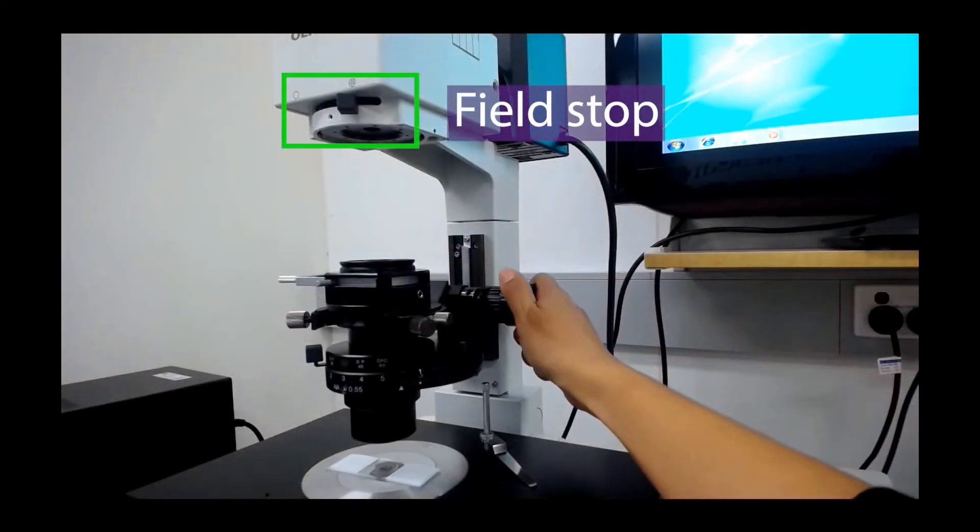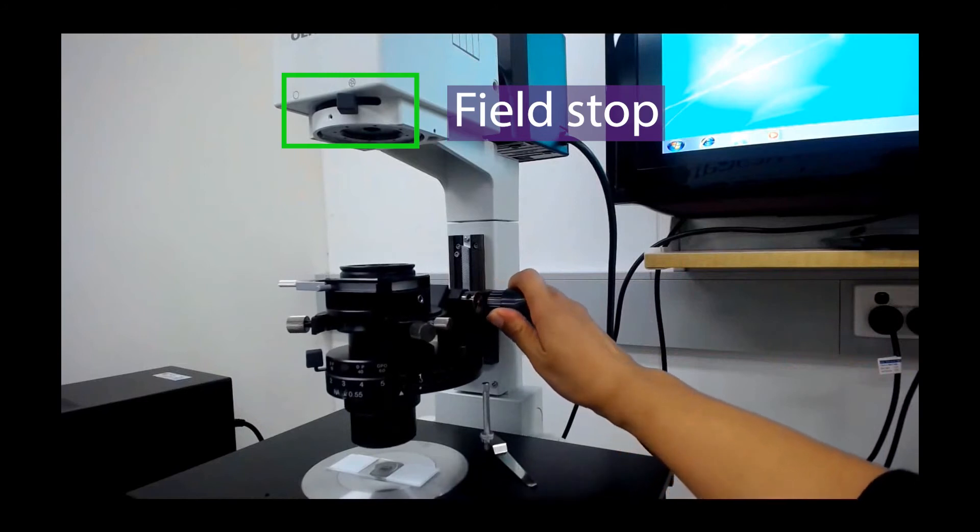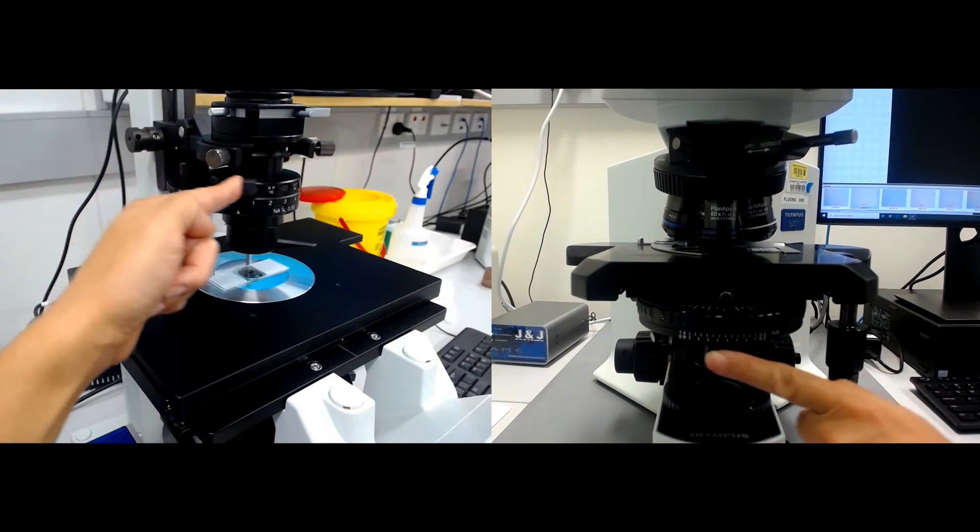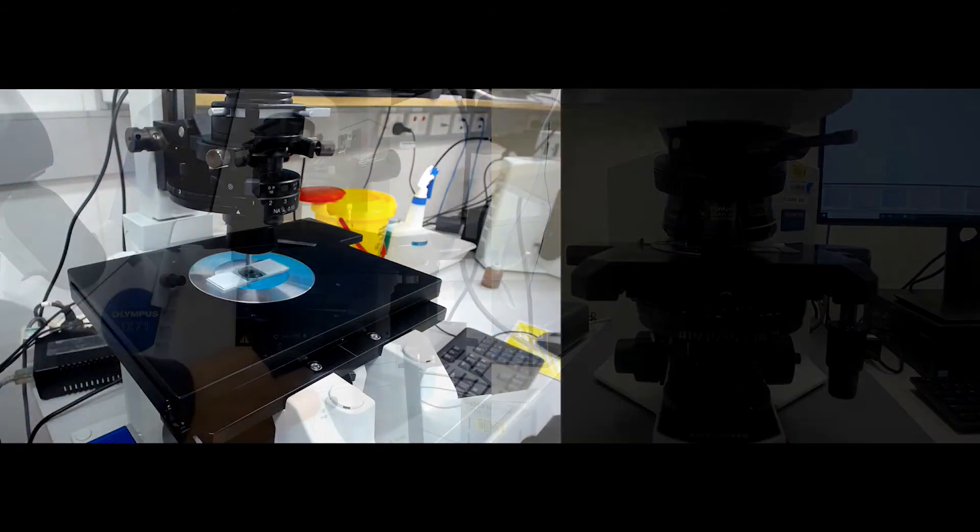Make sure you have adjusted the microscope to provide Koehler illumination. Open the aperture of the condenser to the fully open position, otherwise you will not illuminate your sample.